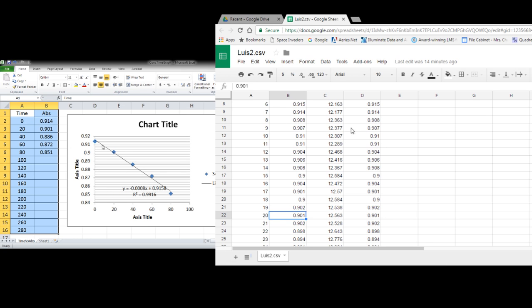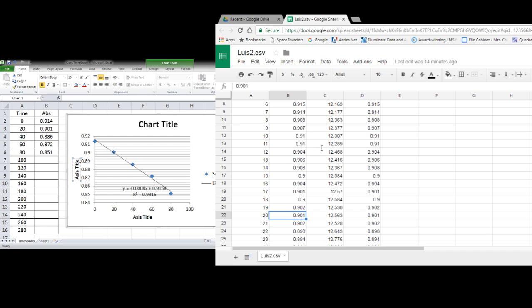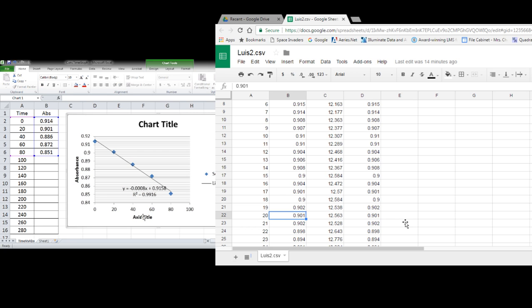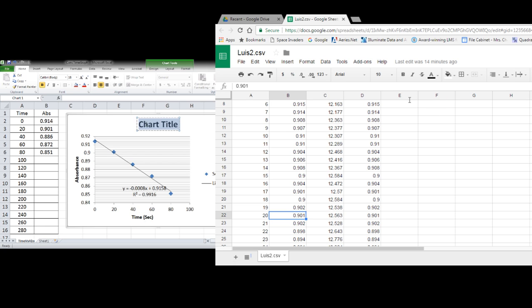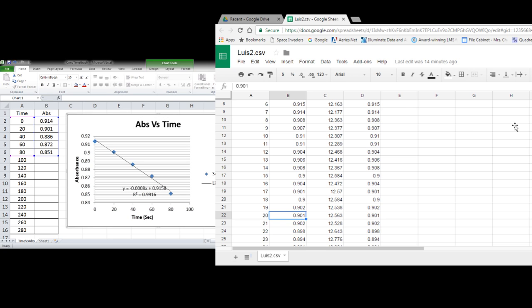And then you can start looking at your different plots. If you want to change titles and things like that, you can do that here. It's kind of weird writing like this, but I can't type, so absorbance versus time or whatever you want to put.